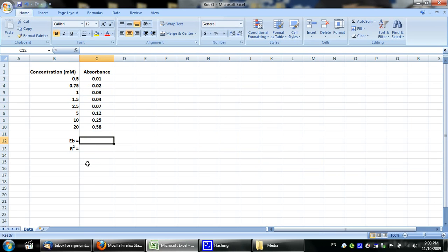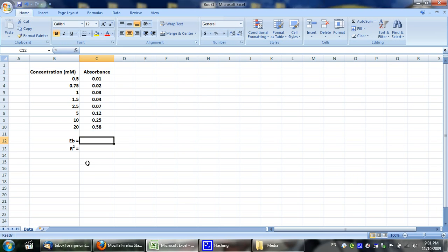There are two ways to get the slope and the R-squared value. One is just by doing the formula, and the other is by doing a plot with a best fit line. I'll show you both methods quickly.